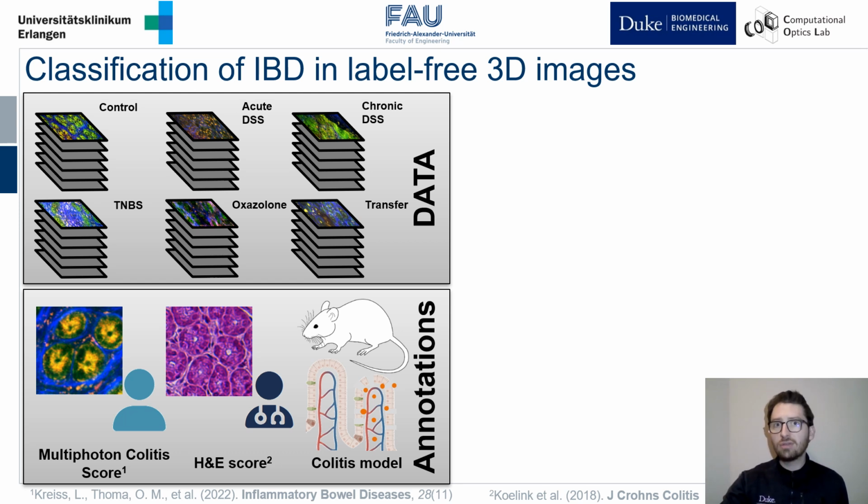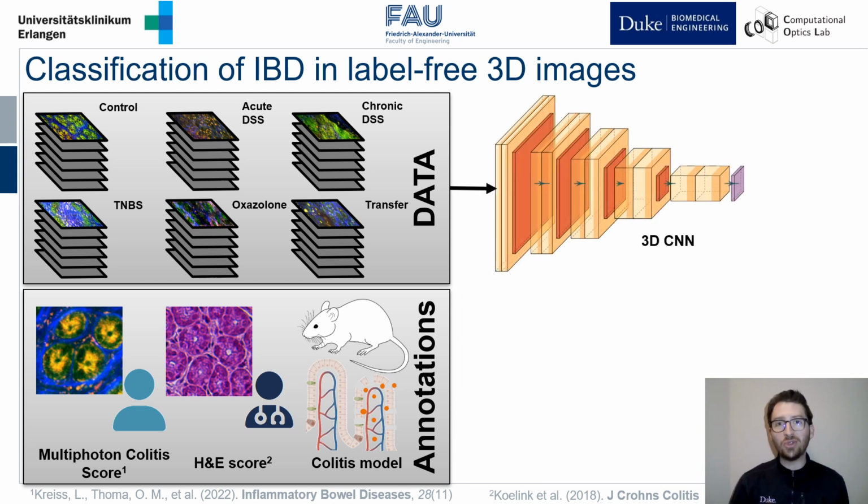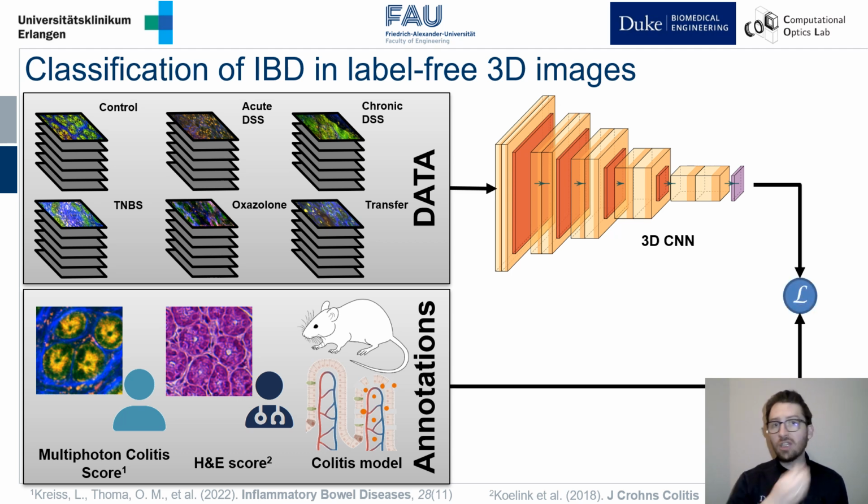And of course, if we have data and annotations, it's already very suggestive to do machine learning. And the goal here is to train a deep neural network with these label-free images as input to then derive the reference diagnosis.